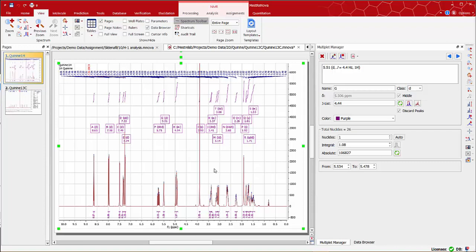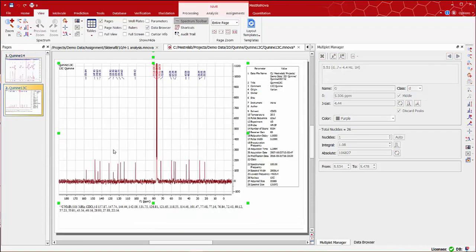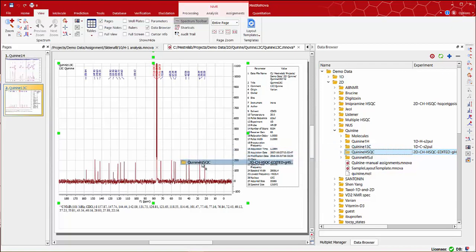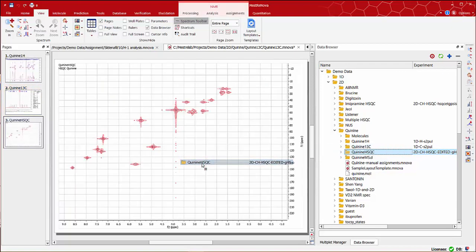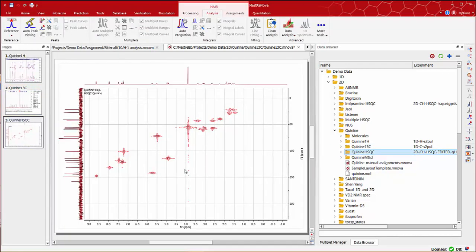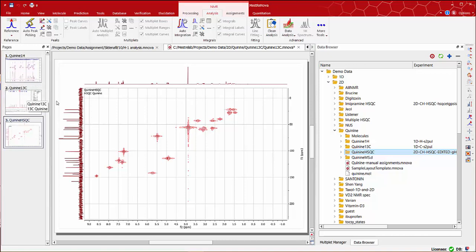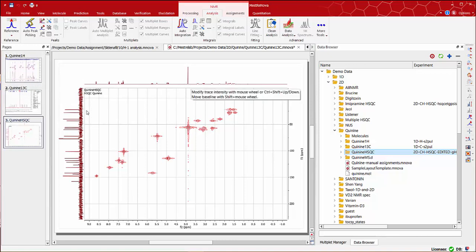I'm going to use the 1D traces proton and carbon already processed and shown in previous videos. As before, let's start by dragging the RHSQC dataset from the data browser panel and into MNOVA's spectral window. As you can see, it is automatically processed. The 1D traces are also automatically displayed in the corresponding dimension of the 2D spectrum.